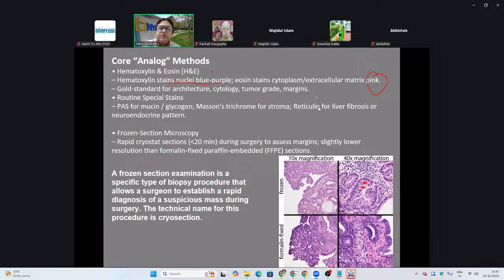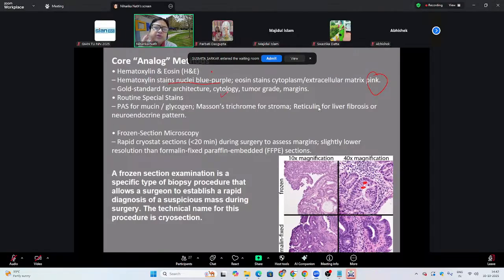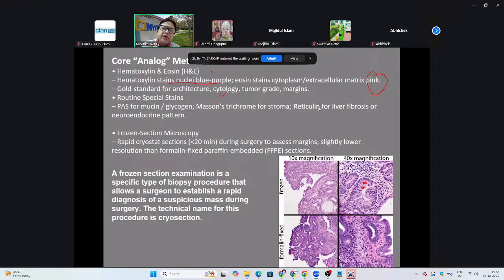And that is used, number one, for cytology for individual cells, as we saw in a pap smear, or you can scrape your mouth. If you scrape your buccal cavity, the inside of the cheek, that will give you single cells. If you scrape your gums, that will also give you single cells.